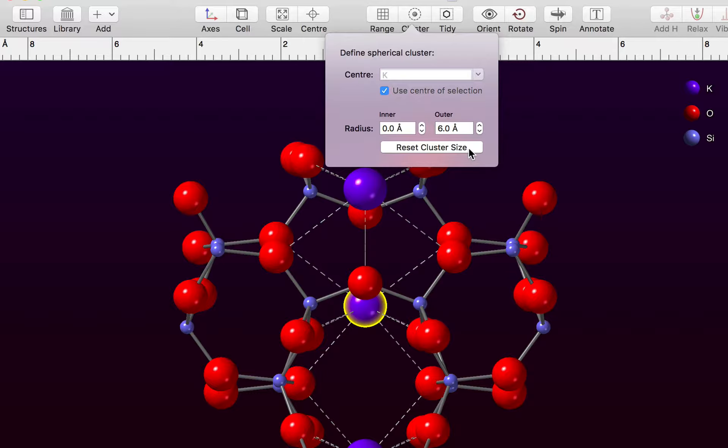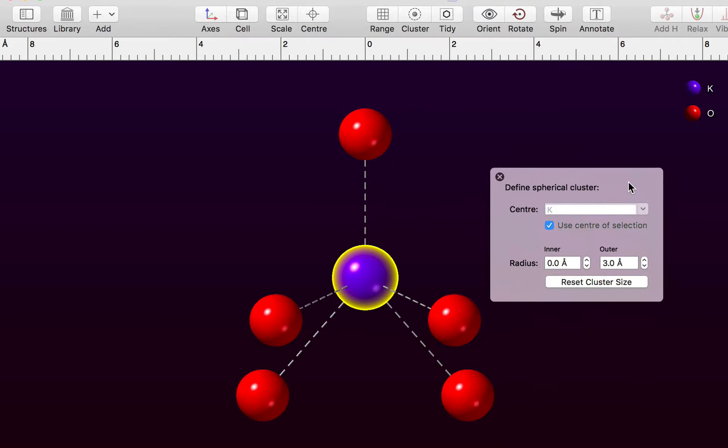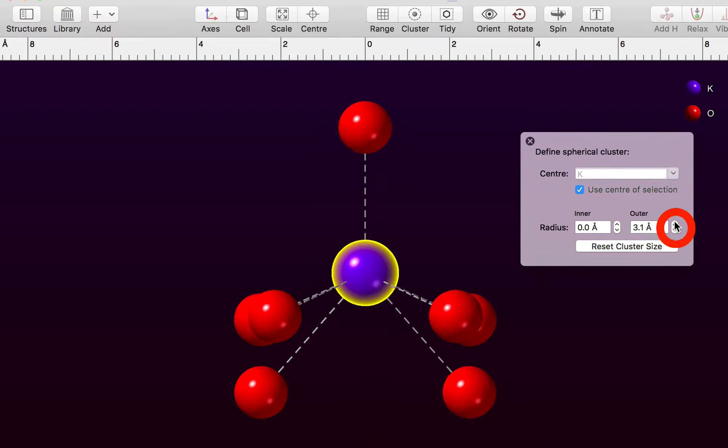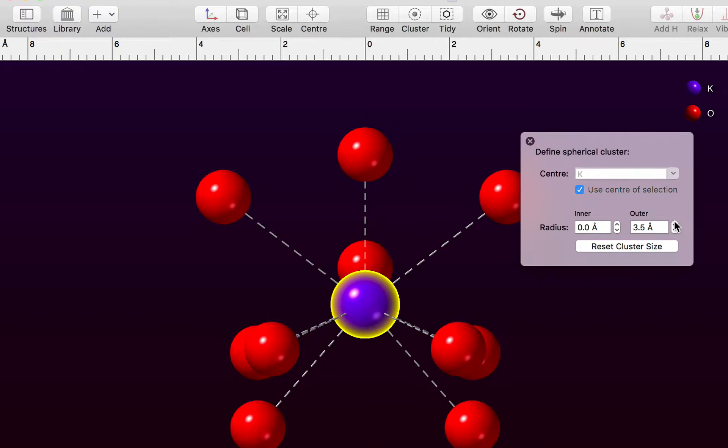Now we can press the reset size button to show a three angstrom cluster. I can actually drag this box away so we can see a bit more about what's happening, and we can expand the size of our cluster by using the up down buttons here.